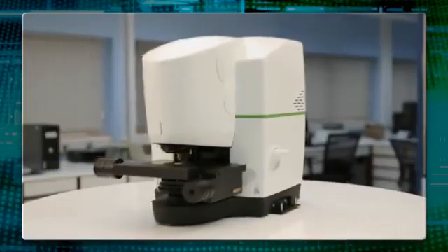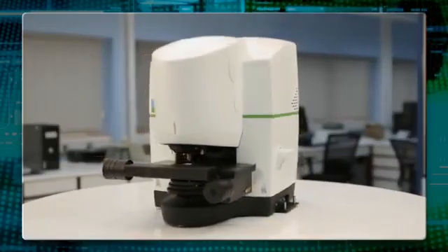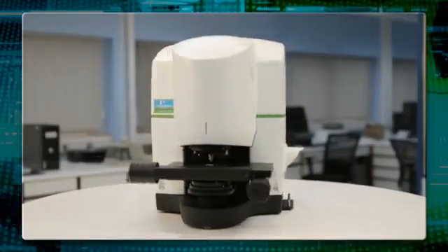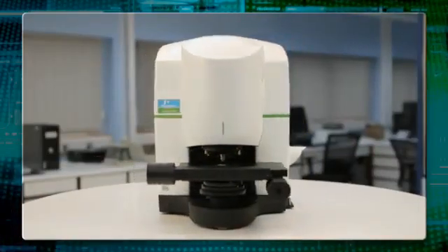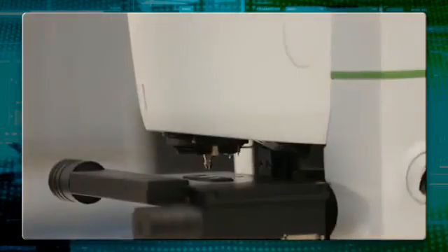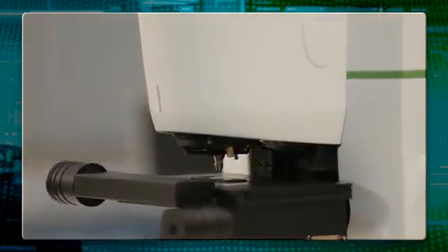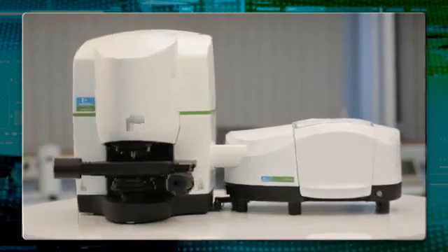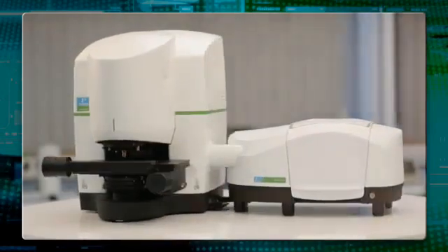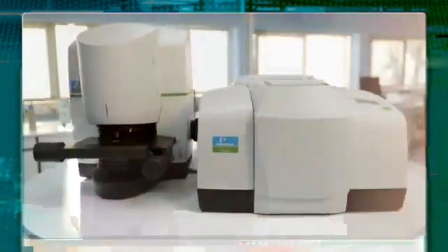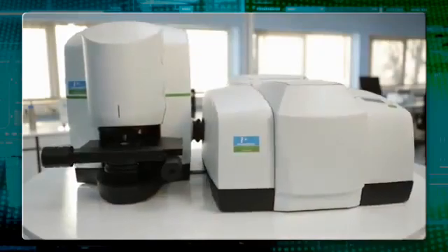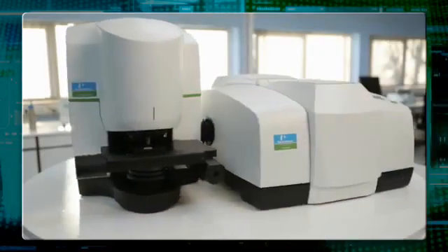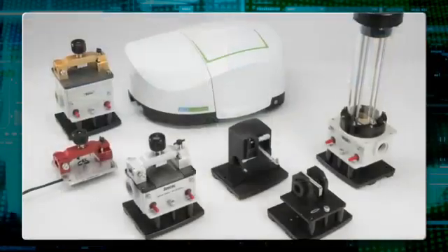PerkinElmer offers two FTIR options with Spotlight microscope systems to meet your lab's specific macro-sampling needs. Spotlight is fully automated or available with manual sample stage versions. You can upgrade your existing Spectrum 2, Spectrum 100, or Frontier FTIRs, so moving to FTIR micro-sampling is easier than you think.